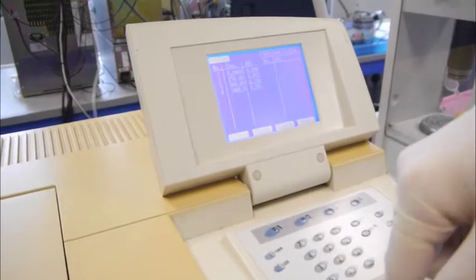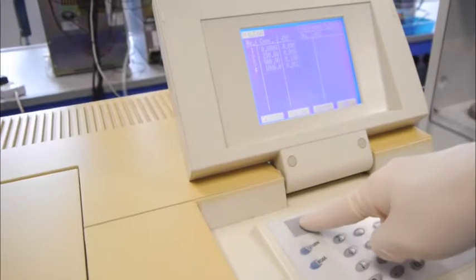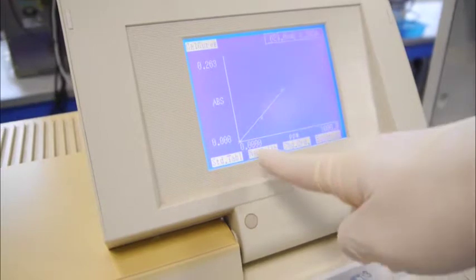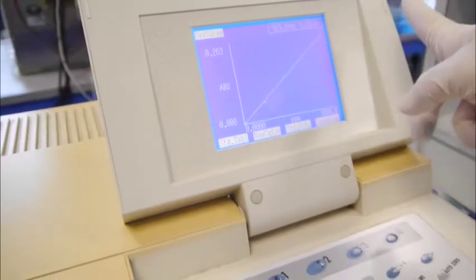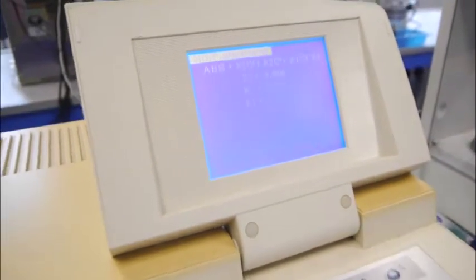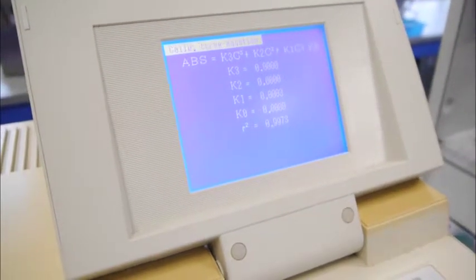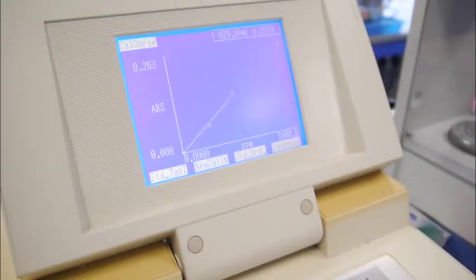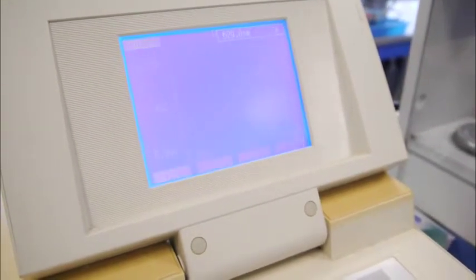Once you have done that, you can view your calibration curve under F1 to check the linearity of your standard curve. If you want the equation, you can refer to the equation and the R value under F4 equation. To return back to the curve or to the measurement, you can press return.